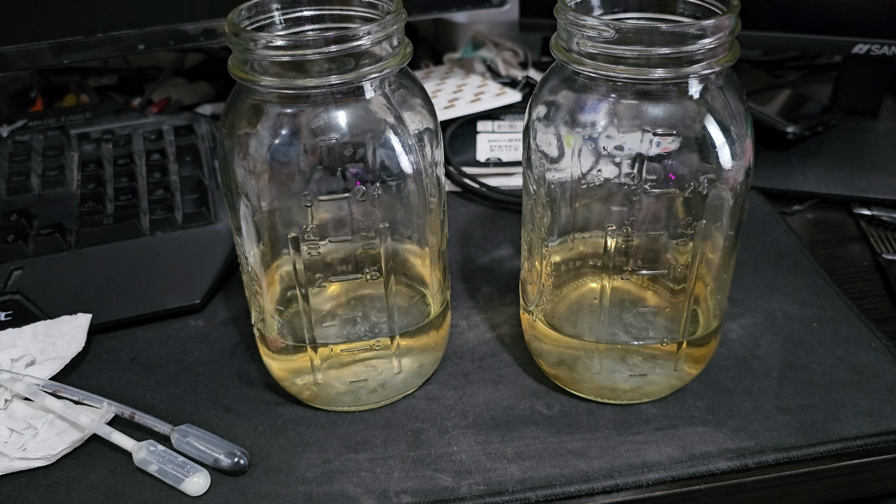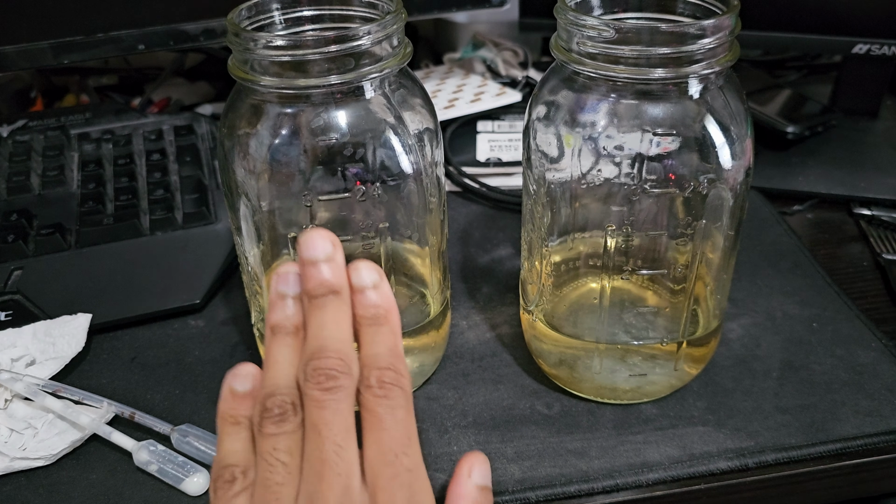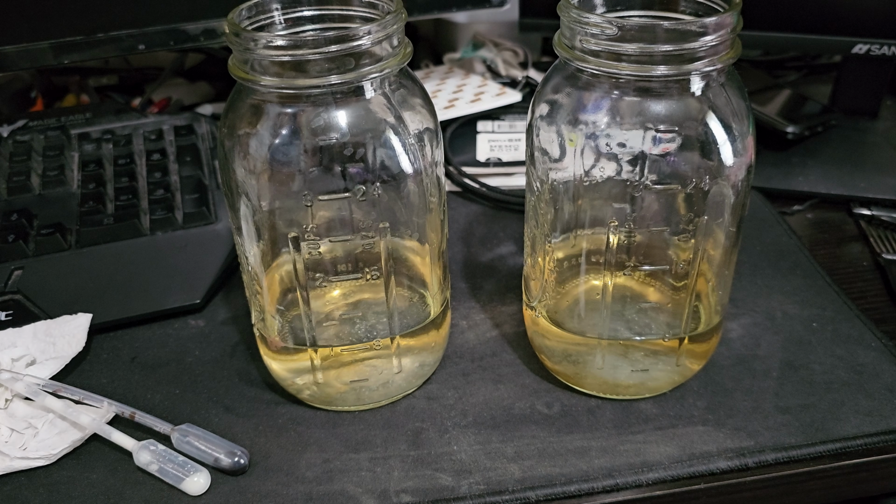Interesting looking solution. So this is the fish tank, and this is the distilled water. I don't have any good tape to label it. Although what I'm gonna use for tops, I'm not gonna seal it with just the regular jar covers like this, just allow some air to get through. I'm gonna take, like I did last time with the other one, some paper towel and put it over it.